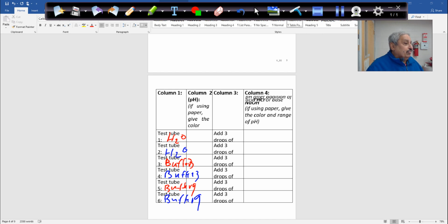Just an estimation. What will be the pH of tap water? Will it be exactly neutral? You will test it yourself. Well, it will not be neutral, though it should be, because they are using an exchanger to get all the ions out, deionize. They call it deionize, to take all the ions out. So it will be around 6. So it's a little bit mildly acidic. So tap water is a little bit acidic.